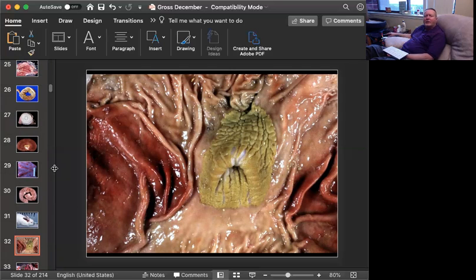This is the pars esophageal. It's sort of a squared or rectangle area right around the esophageal entry into the stomach. And this is where all the ulceration occurs. Sometimes you will see just a big clot covering this area, or if that's taken off, you'll see a large ulcerated area, maybe with a hyperplastic edge.